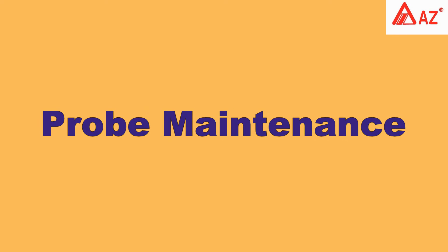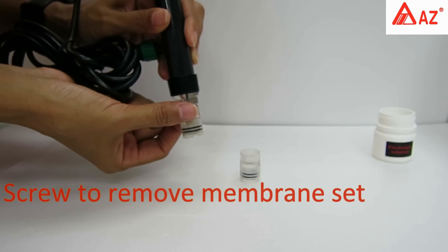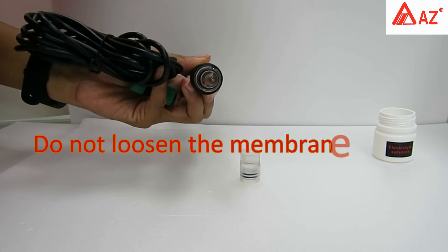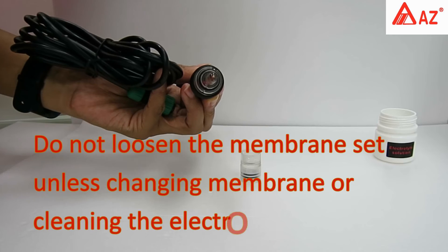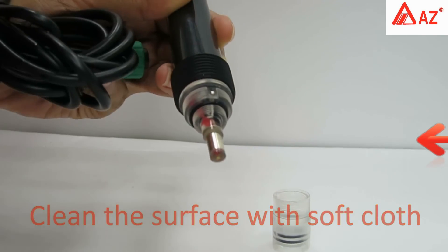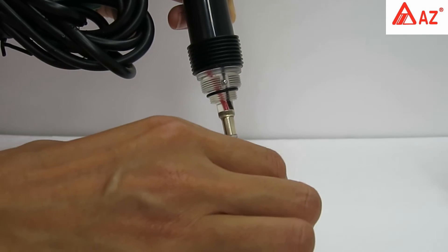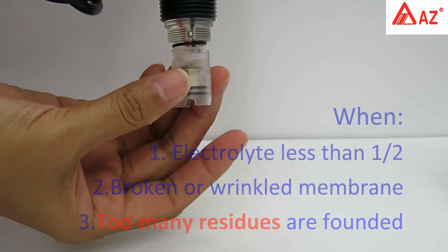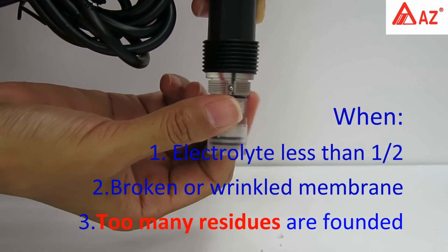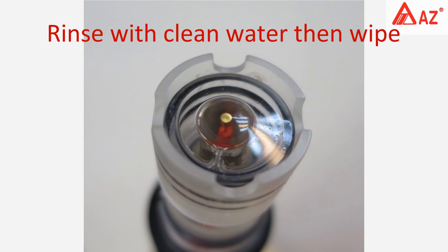Probe maintenance: pour electrolyte solution into the new membrane set until full, then remove the membrane set from the probe. Once removed, do not reuse the same membrane set. Do not loosen the membrane set unless you need to change it or clean the electrode. Use a soft or long-fiber cloth to clean the surface — you can use a fingernail or knife to scrape off residues, then wash with clean water. Replace the membrane set when dissolved oxygen electrolyte is less than half, the membrane is broken or wrinkled, or there are too many residues on the electrode working area. Install the new membrane set with full electrolyte, hand tighten, rinse with clean water, then wipe dry.